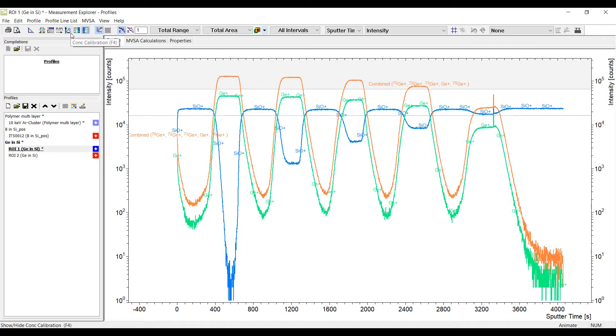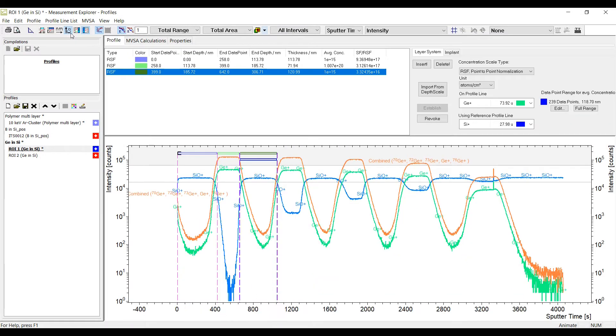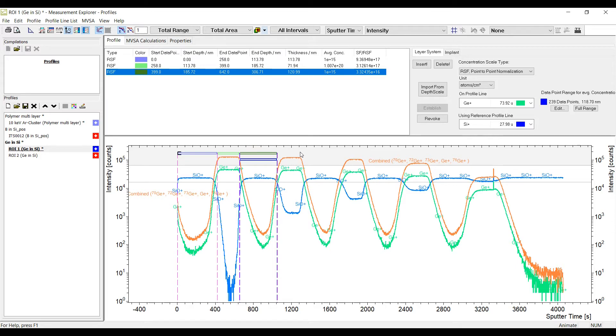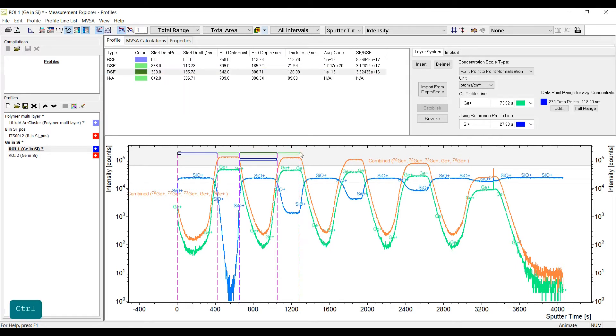The concentration calibration is now a toolbar and not a separate dialog anymore. It can be opened with the respective button or with the shortcut F4 as always. You can distinguish between two different applications: layer systems or implants.